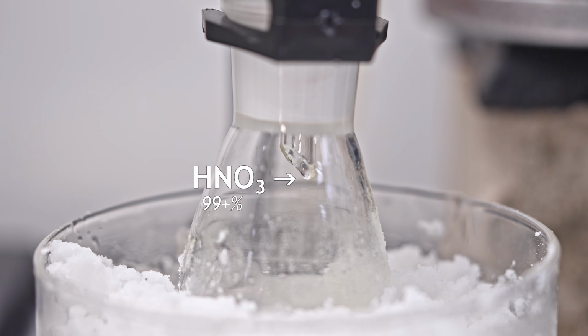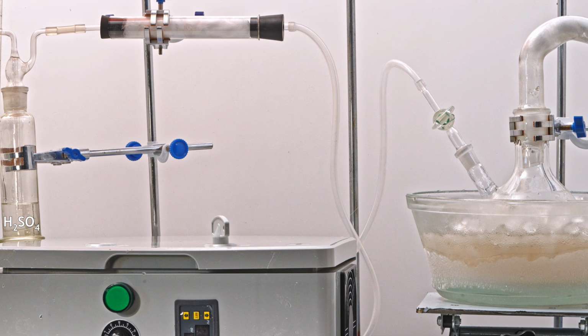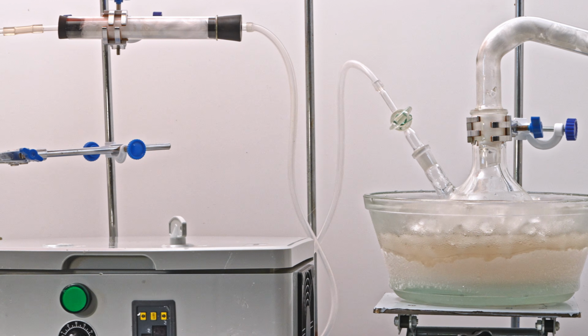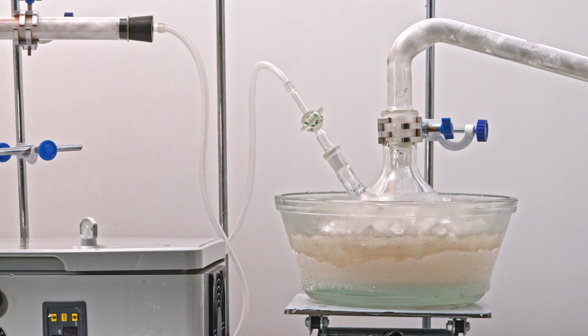And now, take a look at the setup for producing dinitrogen pentoxide. So first, we need very dry oxygen. For that, the oxygen passes through a wash bottle with sulfuric acid, and then through a tube packed with phosphorus pentoxide before entering the ozone generator.